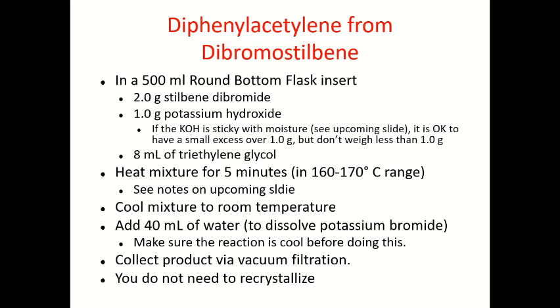You have to heat the mixture for 5 minutes in the range of 160 to 170 degrees Celsius. Then you have to see the note on the upcoming slide. Then you have to cool the mixture to room temperature. Add 40 milliliters of water to dissolve the potassium bromide.